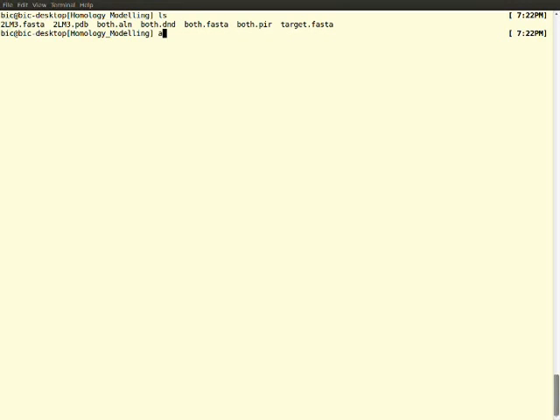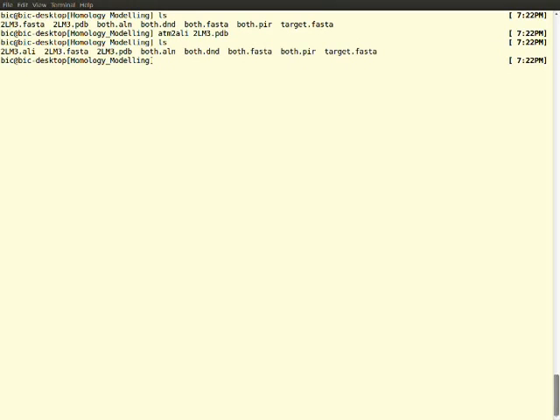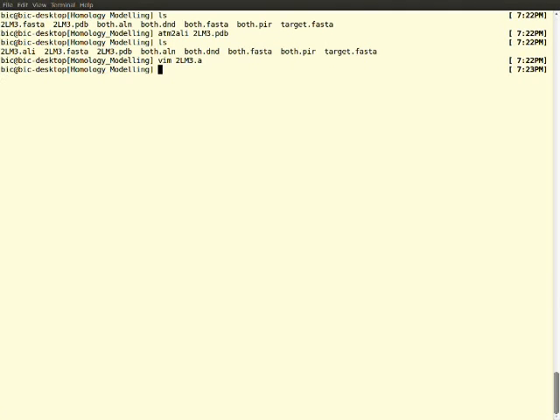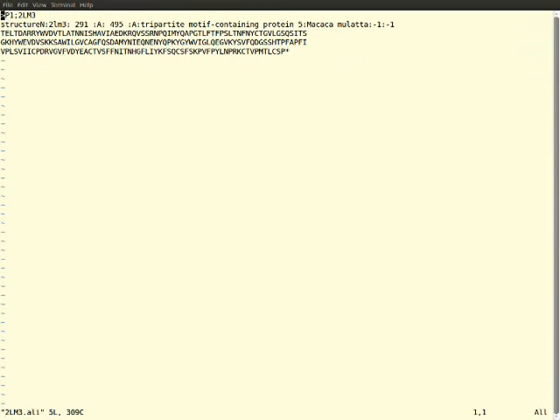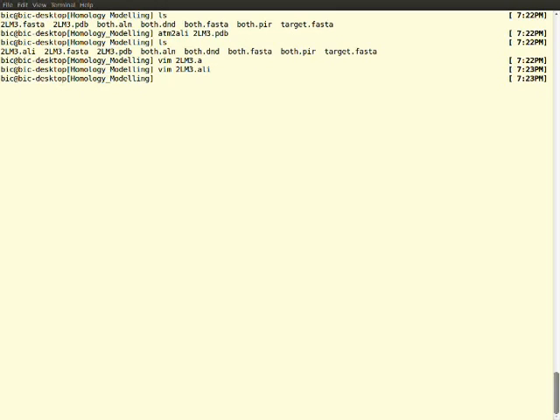I want PIR format output also. You will come to know why we are using PIR format - it will help us create alignment format from it. I am pressing 2 to activate PIR format, and we also require ALN format, which is already there. Now I am doing complete multiple sequence alignment by option 1. The files are generated. Output files have been generated from our ClustalW experiment, for example, the ALN file and PIR file. There is one more tool called ATM2ALI from the package of Joy. You can refer to the website on how to install Joy. Using ATM2ALI, we can annotate our structure, that is the 2LM3 PDB structure.